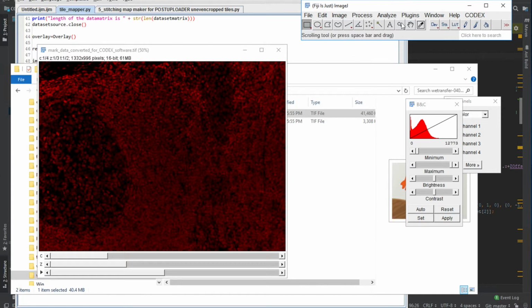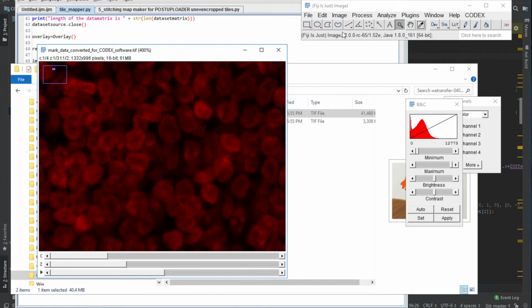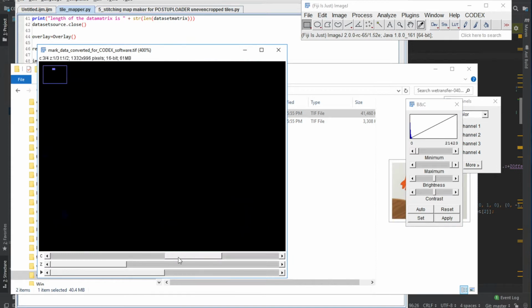It's about 6,000, 4,000, 5,000 for the positive, and 300 for the negative, right? And actually, you can see the bimodal distribution where your first peak corresponds to basically the background. So we have about 4,000 to 5,000, or maybe 4,000 average for the positive signal of the nuclei.